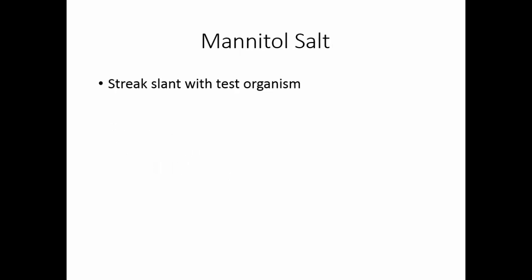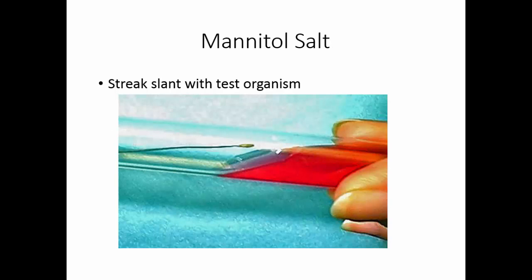Mannitol salt comes as an agar slant, so all you need to do is streak the slant with the test organism and then incubate the slant for 18 to 24 hours at 35 degrees centigrade.